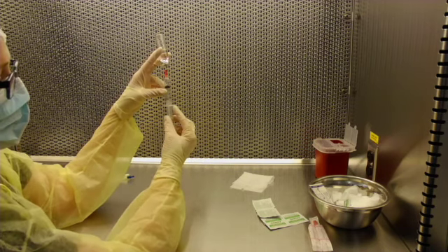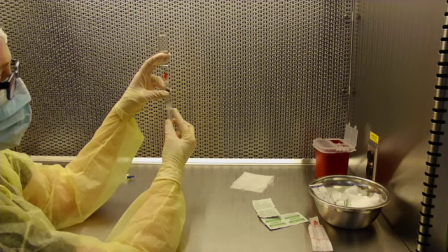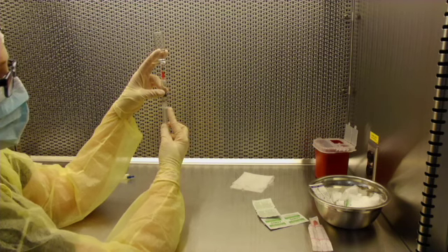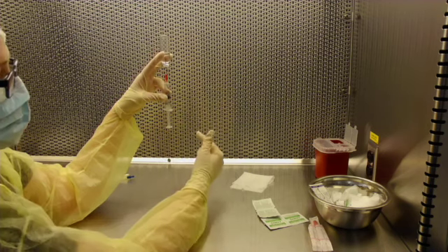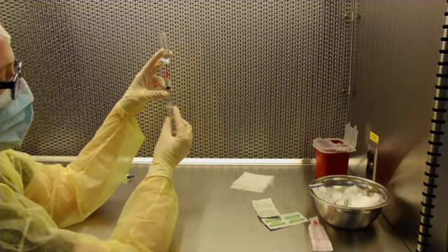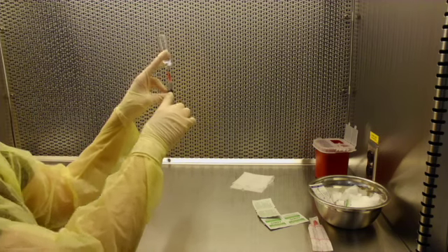The most important thing to note is that you're always seeing the silver of your needle and the rubber septum, as well as the plunger of your syringe here. Having the ease to be able to pull your vial up into the air helps as well as you're withdrawing fluid, and fluid goes more towards the rubber septum. You can pull your needle back to be able to gather all that fluid from your vial.